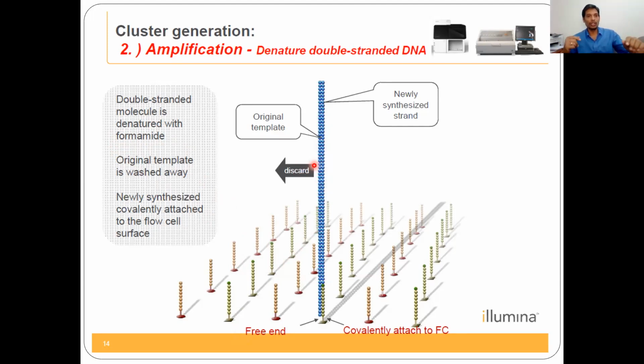Then you inject some more buffer so that the original strand will be washed out, because the original strand is attached only through the hydrogen bonds with the newly synthesized one.